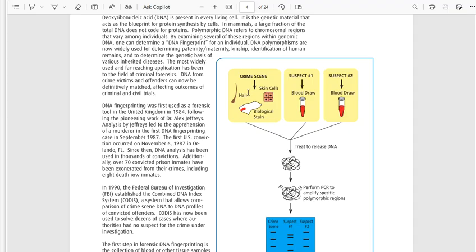So what that means is that in our previous electrophoresis experiment, we focused on identifying parents from children who maybe have been separated from their parents in some form or fashion, whether that's through migration problems or through war times, or that scenario, of course, was written for wartime. But children get separated from their parents quite often, and this was one of the ways that we could help determine who's the mother, who's the father, is there an overlap, is there something that commonly goes across the board.